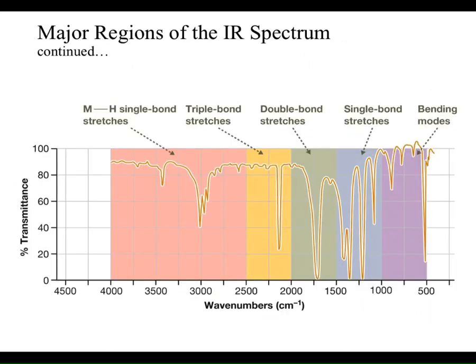So what we've got here is a nice general form. If you take a look at the x-axis along the bottom, it's referencing wave numbers, or inverse centimeters, so centimeters is in the denominator. What things, according to light, are measured in centimeters? Well, wavelength is in centimeters. And if I do h nu, I've got energy. So inverse wave numbers is effectively energy. It's directly tied to it.